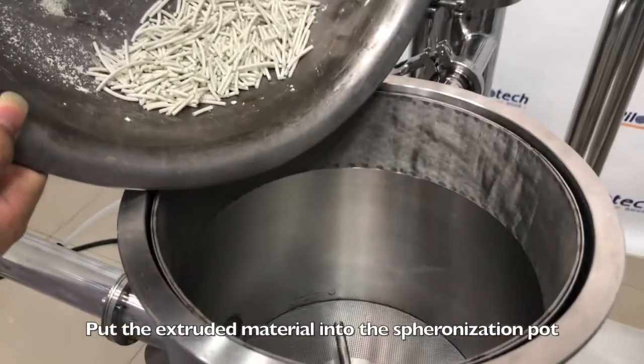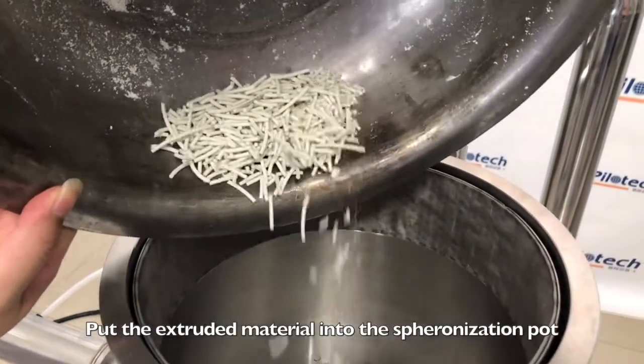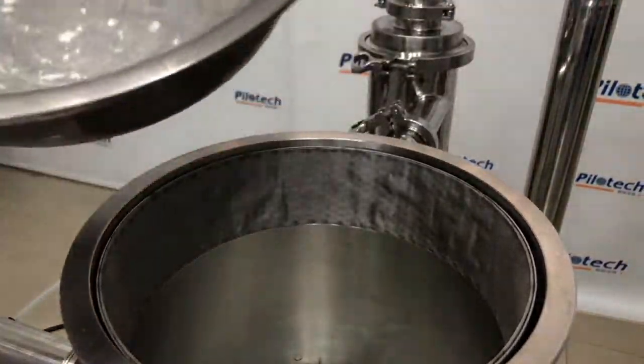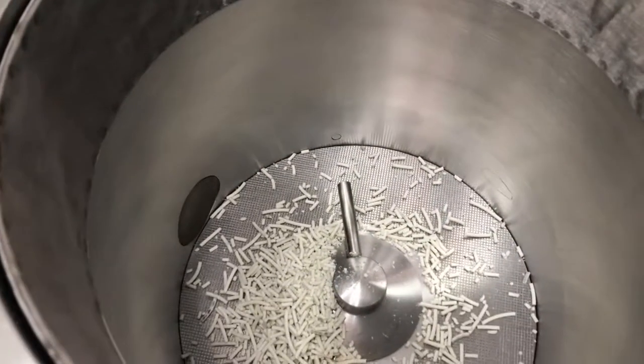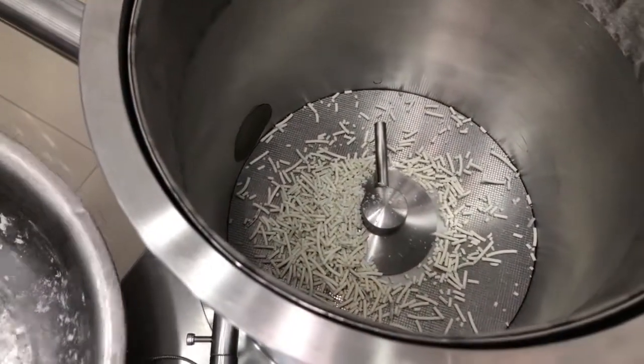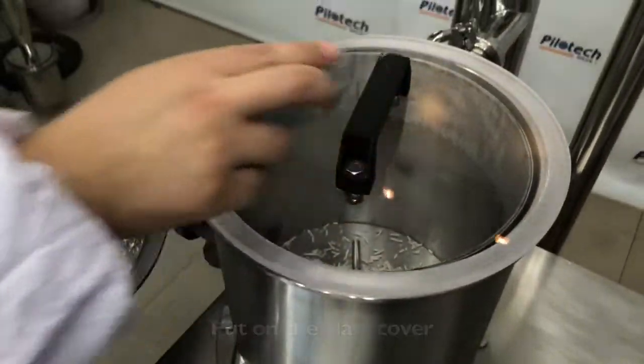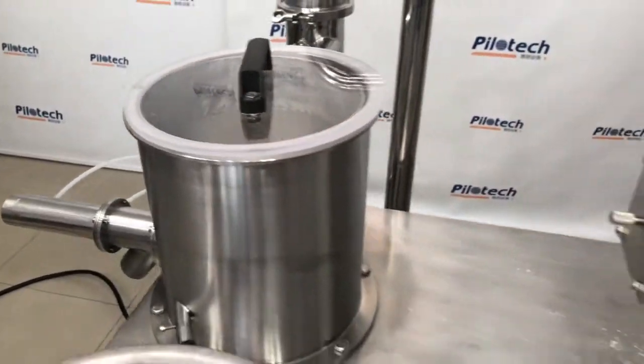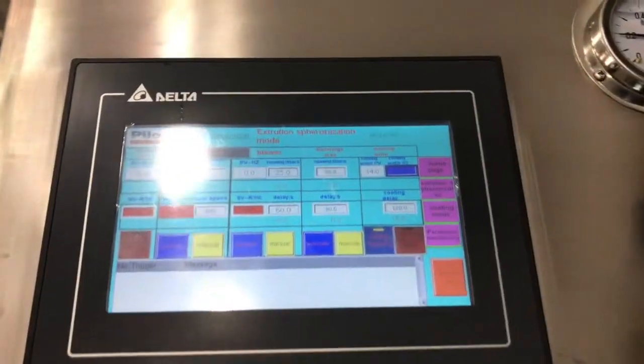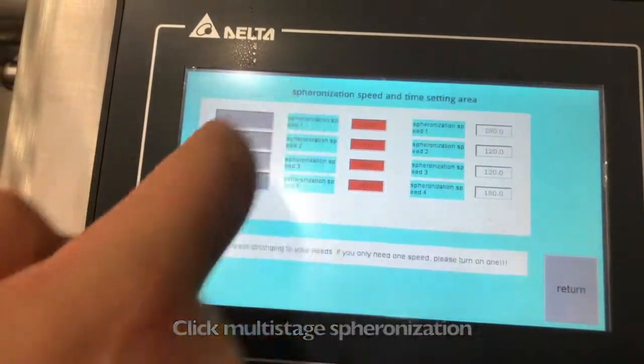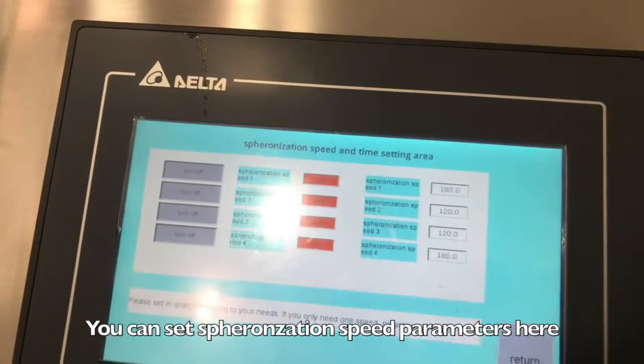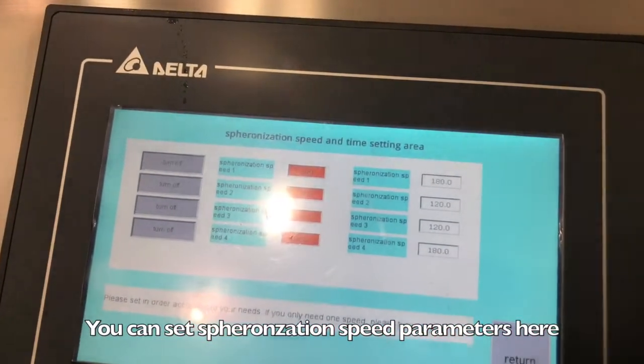Put the extruded material into the spheronization pot. Put on the glass cover. Click multi-stage spheronization. You can set spheronization speed parameters here.